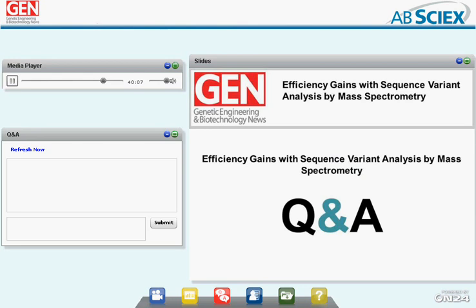Okay. Another question, Jason. Have the interactions with discovery changed as you have started to do this work? We're finding we're doing a lot more work looking at these types of mutations earlier in our discovery phase, essentially looking for clones that may be used to go forward, although when they do end up going into production, oftentimes that material can be cycled back to us for these types of analyses.